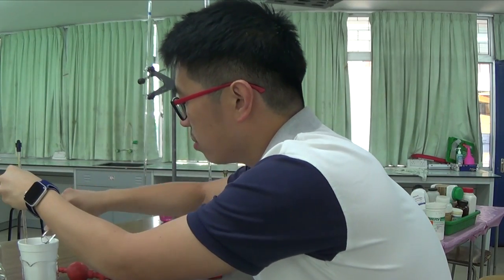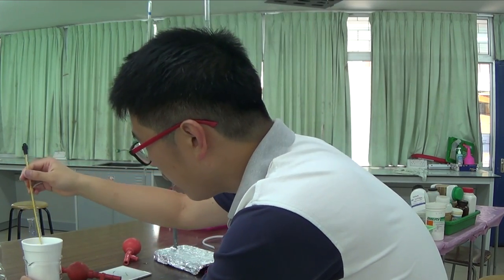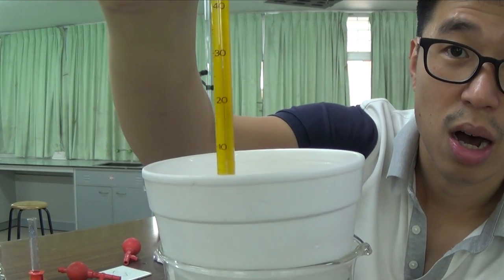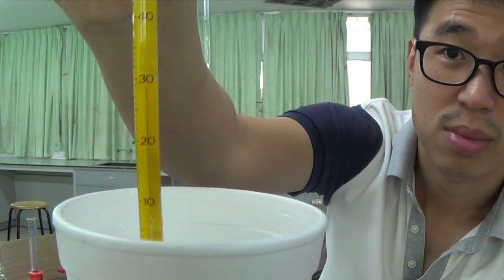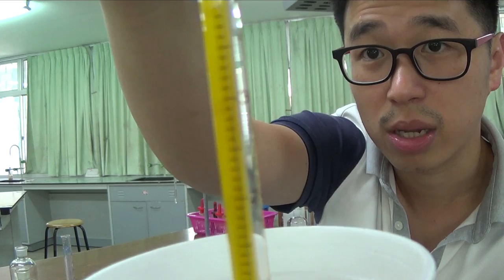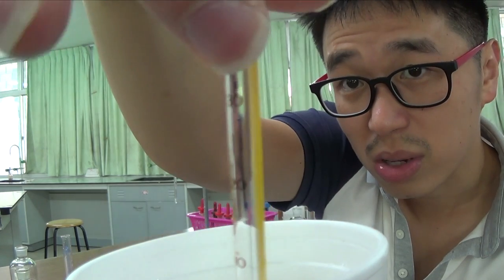I will chuck this in now. And then I will stir it with the thermometer very gently. And then the temperature rises. The temperature is increasing very rapidly. It's now closing in on 30. It is not very clear at all, okay? Let me move this thing around a little bit, because I think it can be more useful at this angle. Now, okay, so I can get it closer. So this is closer to 30 degrees Celsius. Well, the highest temperature was around 29 just now. So it's around that.